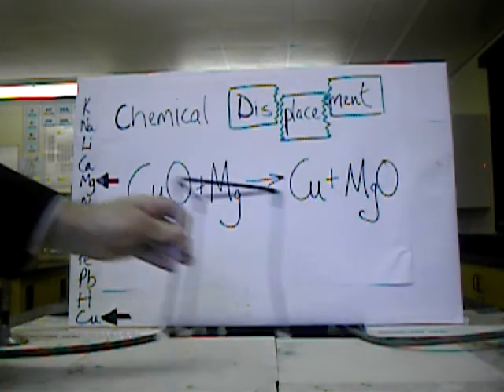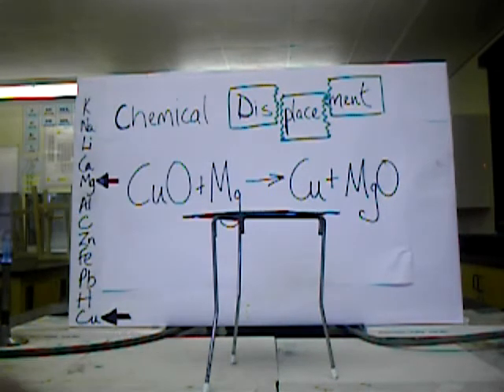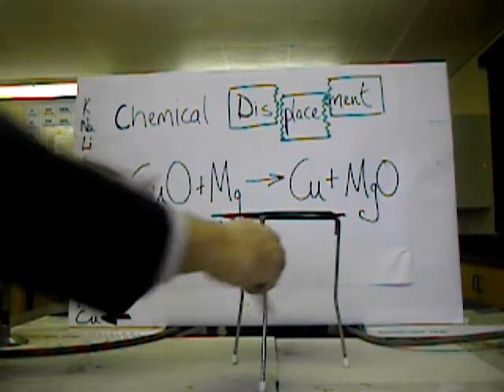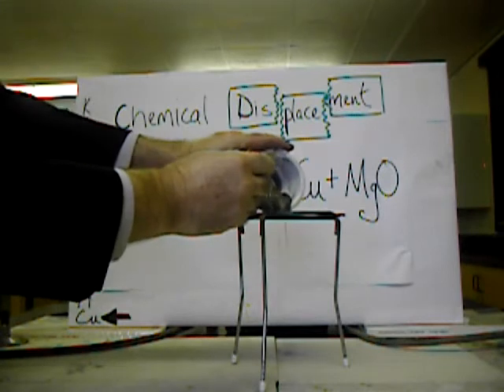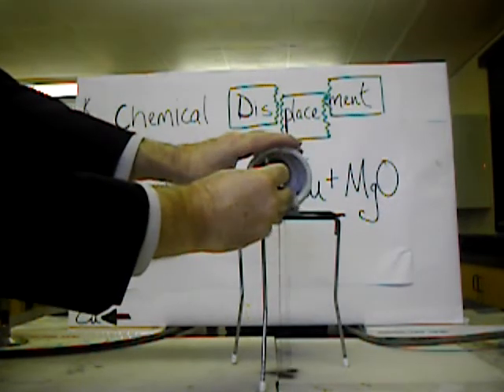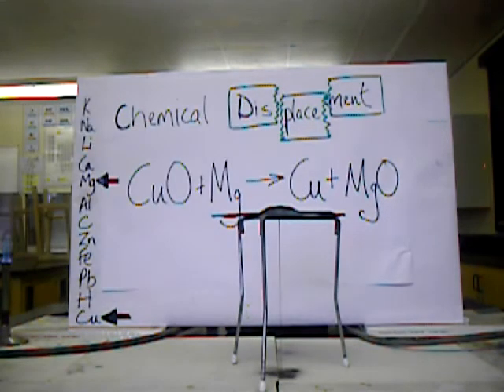I have here a tripod and some gauze. I'm going now to put this blended mixture of copper oxide and magnesium powder there.